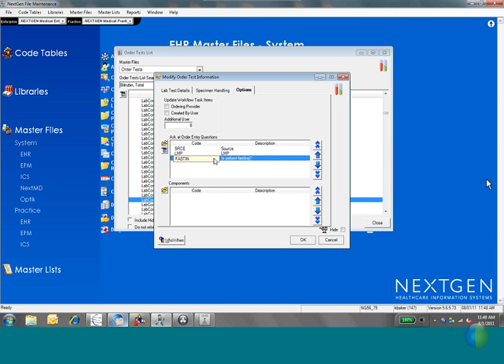So that's what I was saying before. You only have to create the question once and then you link it to each test. Fasting and source are asked on many, many different tests.